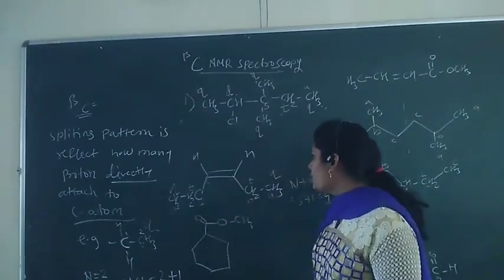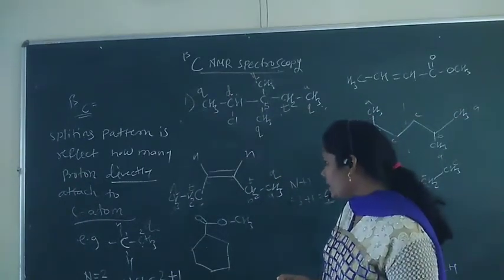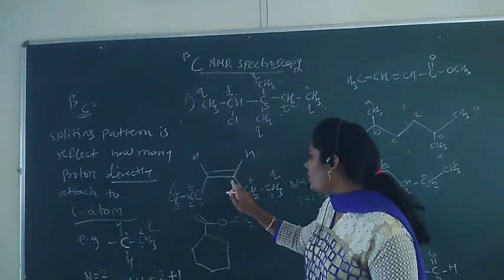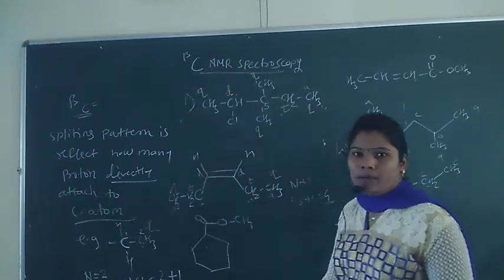In this case only one hydrogen is directly attached to this carbon, so it shows a doublet. This also shows a doublet.